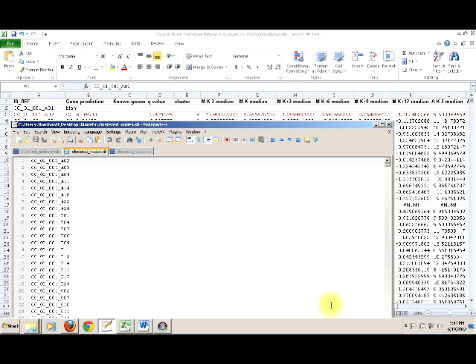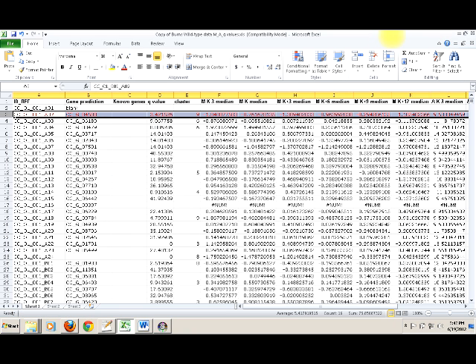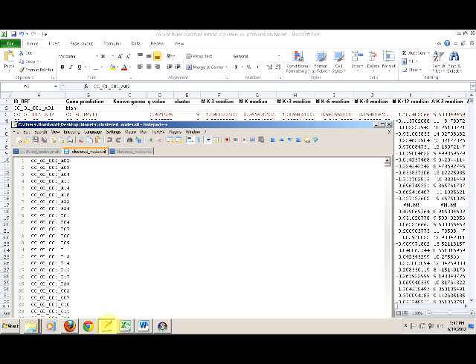Let's start working through some problems related to gene expression data. I'd like to start from the original wild type data that we've been talking about. I've highlighted one piece of data so we can follow it through all the different pieces of the solution for creating a network. I start with the spreadsheet, the wild type data, and save it as a comma-separated value file — a more convenient format to work with from Java. I write Java programs that take this data and convert it into file formats that Cytoscape can use.